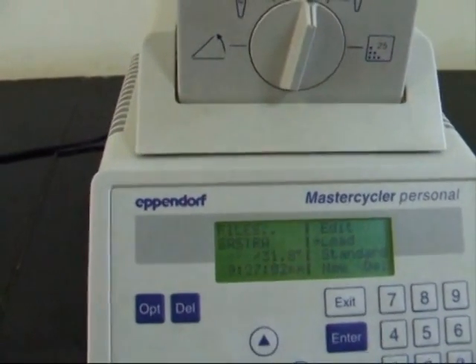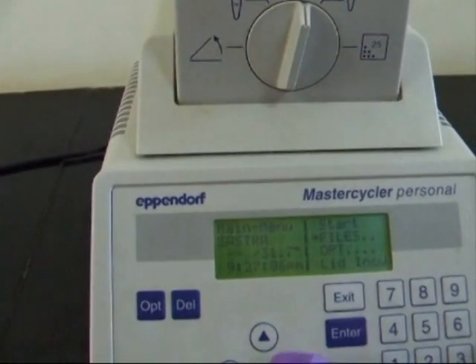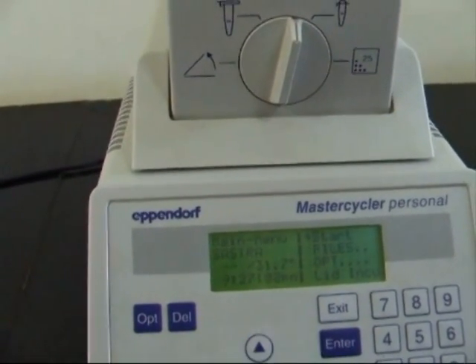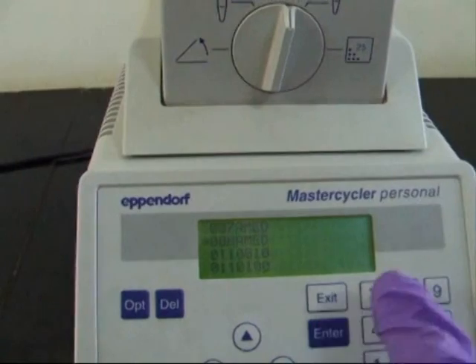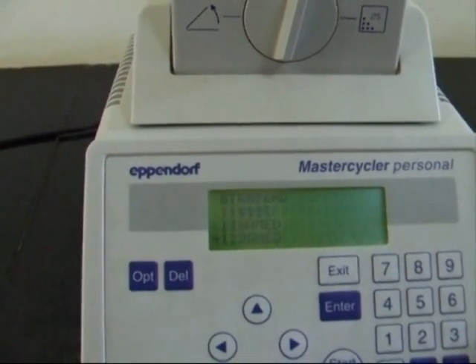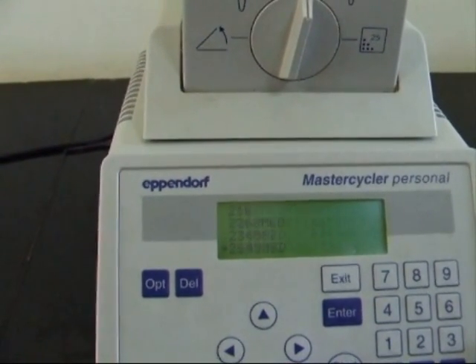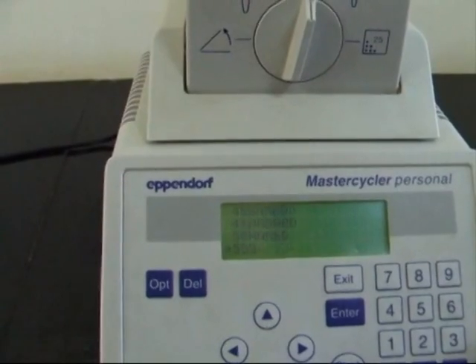In some cases, 1/5 volumes of mineral oil is added to prevent the evaporation of reaction mix. But this poses a problem while loading the sample for gel electrophoresis. So we use a thermal cycler of heat bonnet type that prevents evaporation loss without the use of mineral oil.